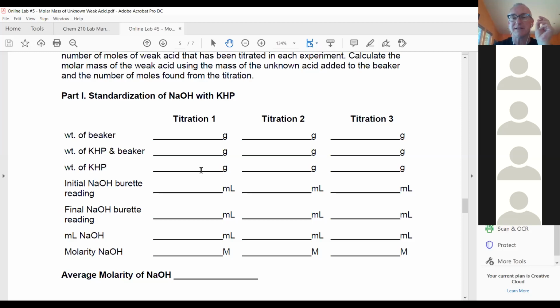Although, like I said, every time I try it, it just goes right to pH 12 or something. I have trouble getting that to work, but you might have better luck with your mouse or whatever you're using.